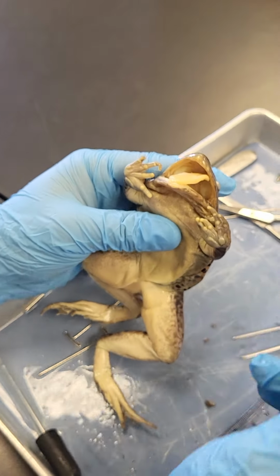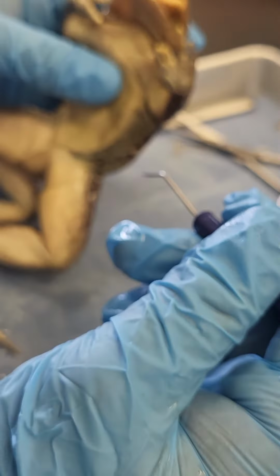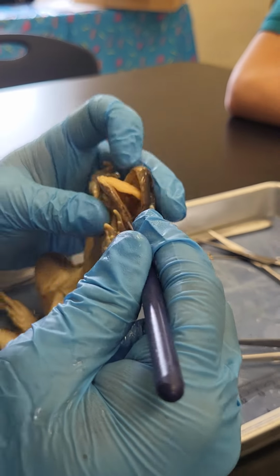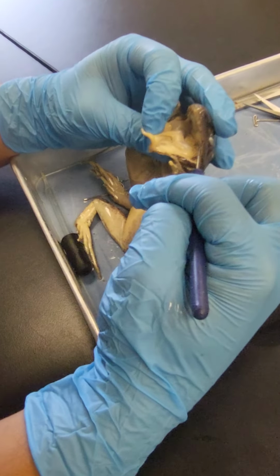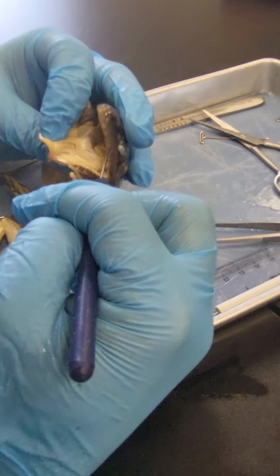Oh no, stop, bro. Are we removing the tongue or something? Did they remove the tongue? No. Just behind the tongue and before you reach the esophagus is a slit-like opening. They already stabbed it. No, they're on the same part as us. Oh, good. This is nasty. Here, bro. I see the slit. Look, I'm rubbing that slit.